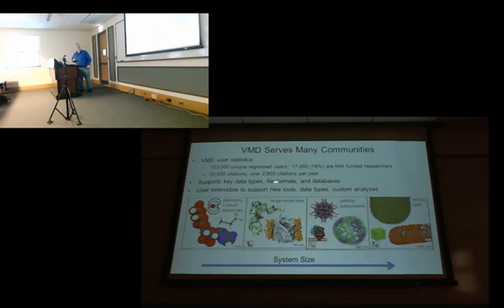It supports a wide variety of data types and molecular file formats, and most of the public databases for structure data and density maps and so on. And it covers a wide range of structure sizes and timescales, ranging from things you'd see in a quantum chemistry calculation with tens of atoms, all the way up to large subcellular organelles and structures like these, and then all the way up to lattice cell simulations.